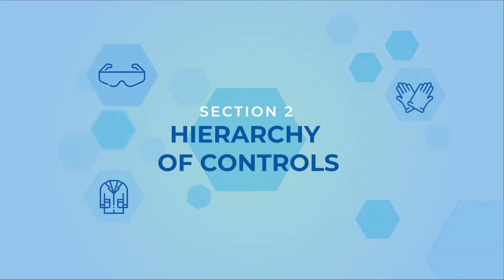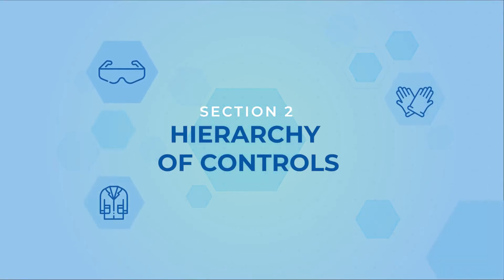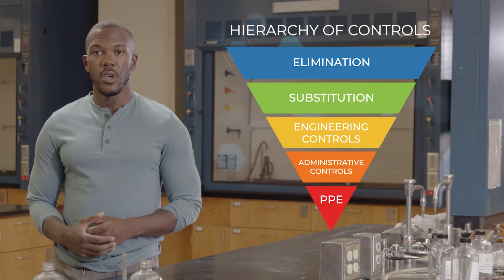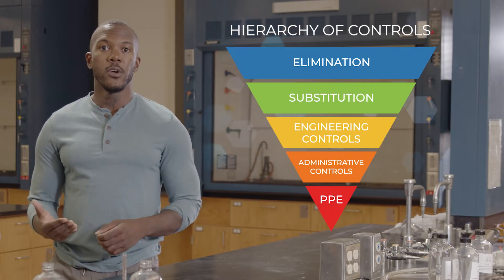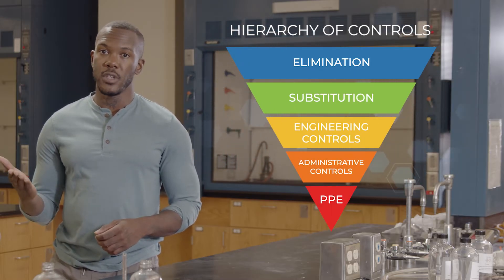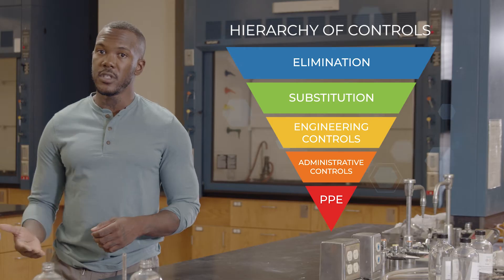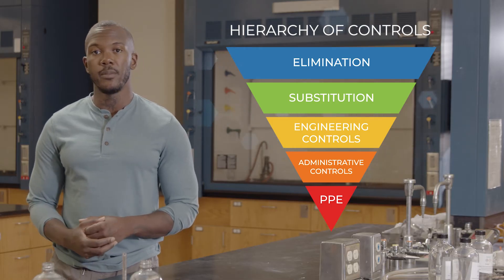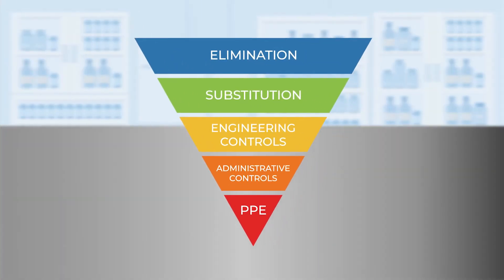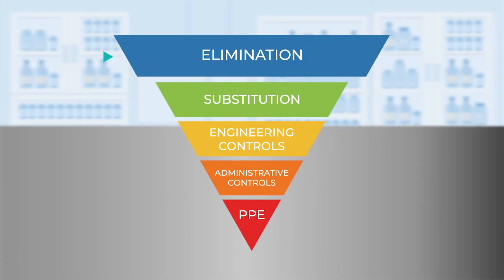Once we've identified these potential routes of exposure, minimizing risks is the next step. A common way to think about reducing risk is the hierarchy of controls. This inverted pyramid shows the most effective strategies at the top and the least effective or less reliable at the bottom. At the top of the pyramid is elimination, which is the best way to minimize risk. If there's no hazard, there's obviously no risk.